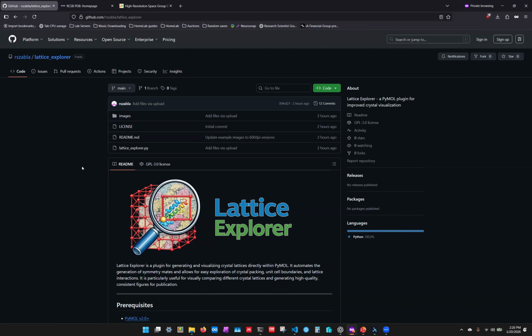Basically, I just want to first start off like, when I say the crystal structure of a protein, I feel like most people don't really know what that is, unless they've taken 3381, and they happen to have not forgotten. Because there's actually a difference between a crystal structure and just a structure of a protein. The most obvious difference being that it was collected using a very specific technique, which is X-ray crystallography. But there's actually more to it, and I kind of want to go over that.